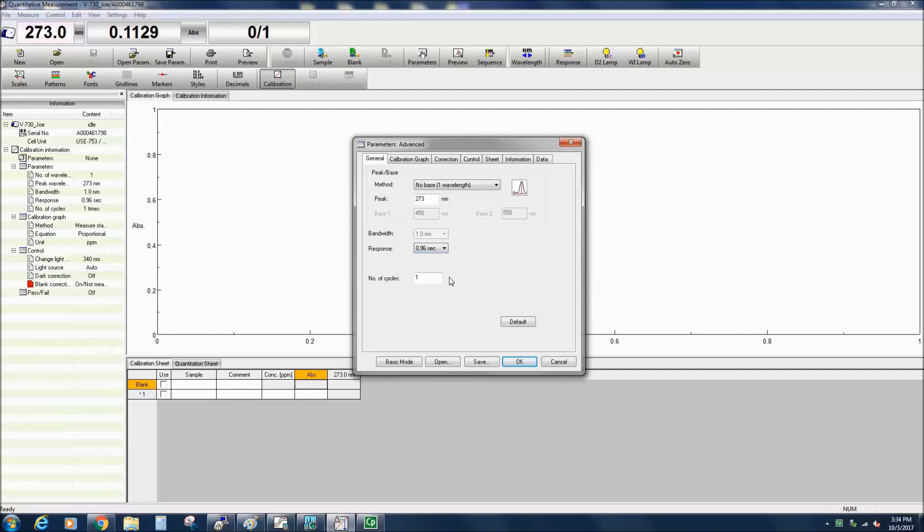The Number of Cycles allows you to specify the number of sample measurements to be obtained without having to manually start each measurement.